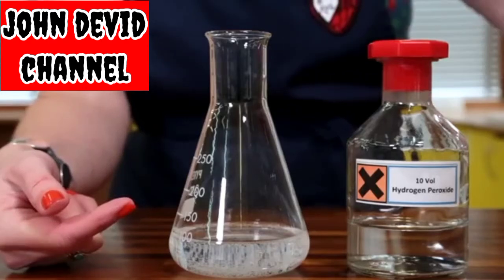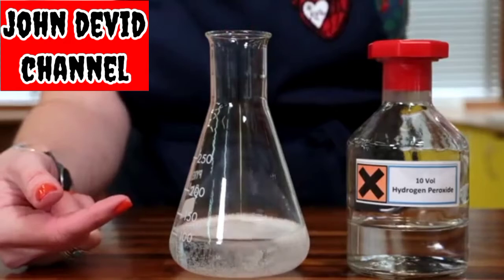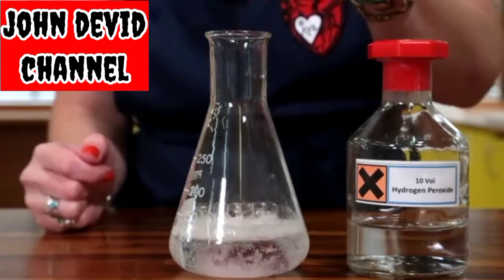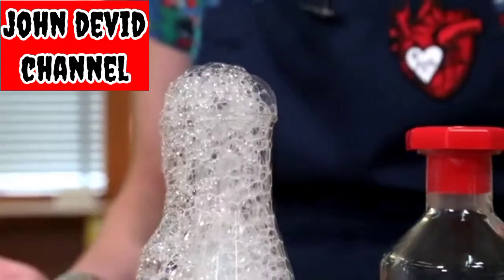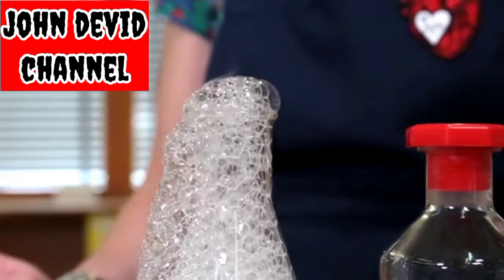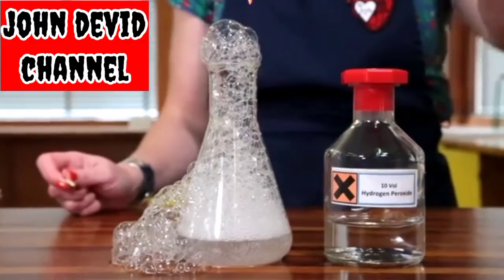We can add some of the liver tissue that we dissected into the conical flask, and you'll notice the chemical reaction is producing a bubbly foam. We can demonstrate this as oxygen by using the glowing splint technique. I can light a splint, blow it out, and the oxygen relights it.